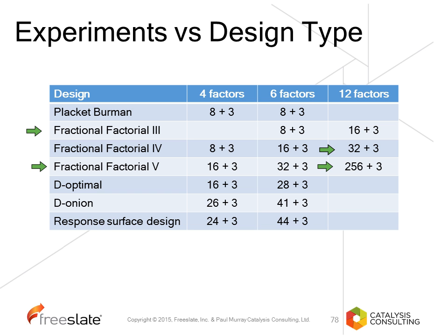If you look at a D-optimal design, the optimal designs, these are mathematical designs that are designed to try and explain some more information. I won't go into those further today, but we have a response surface design. For 4 factors, each factor will be looked at at least 3 levels, so we have 24 experiments. So we have to run many more experiments for 4 factors. But if you've got 6 factors, then you're running a much larger number of experiments. Response surface design should only be considered right at the end when you really understand which factors are important.